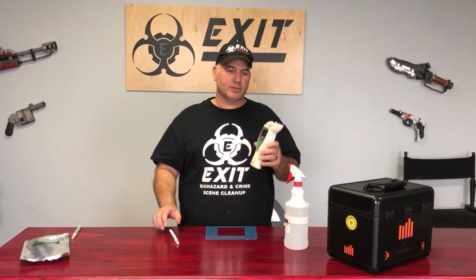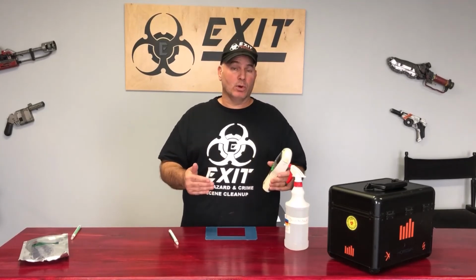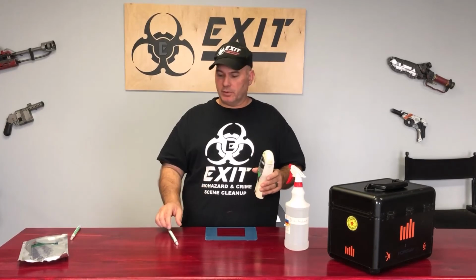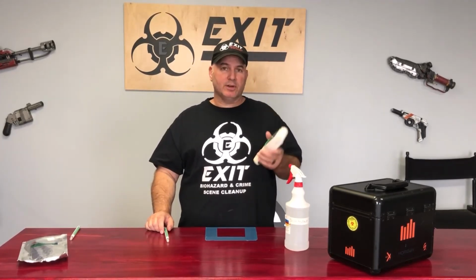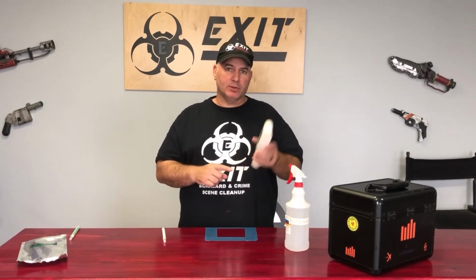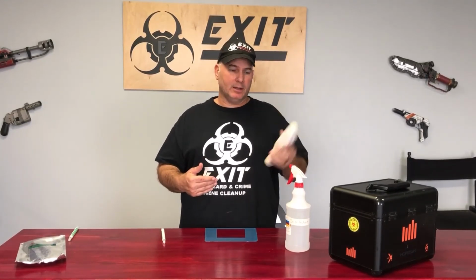I like these testers a lot for that purpose. It lets me know that our chemicals are working, that our techniques are working. Again, it's just a tool to use with the rest of our things. These get pretty expensive, and the machine is very expensive, but one, it makes you look professional because you're using professional tools to show standards, so that what you're saying you're doing, you can back up with hard data, right?